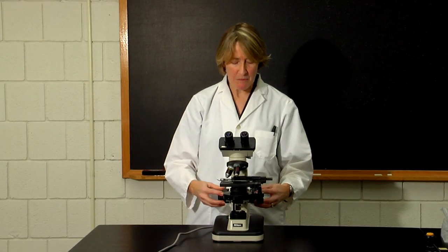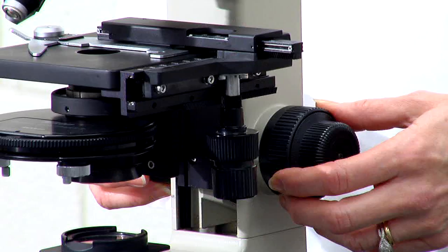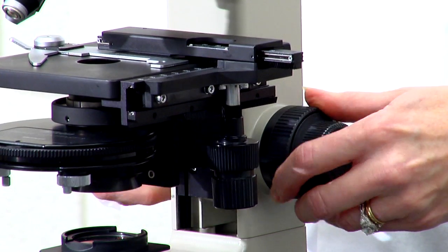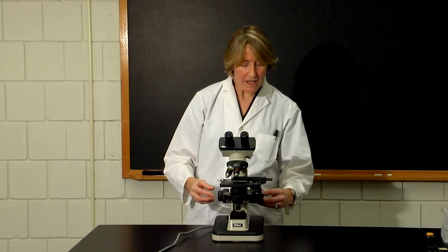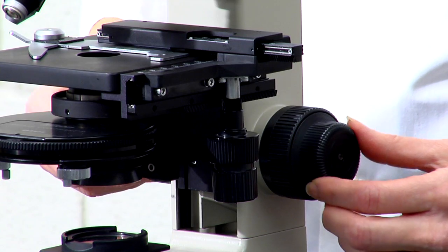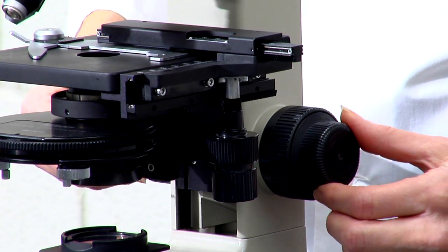You also have a set of coarse adjustment knobs. These can be found on both sides of the microscope. They are used to get the object nearly focused. Within the coarse adjustment knob is the fine adjustment knob. This is for bringing the object into final focus.